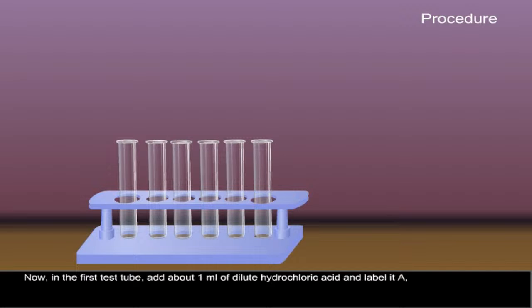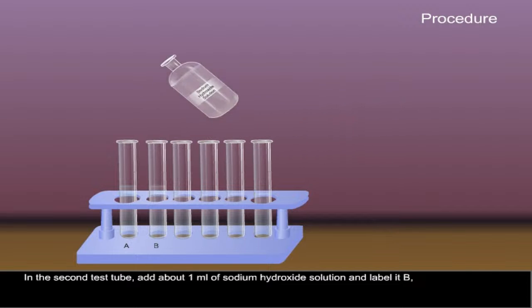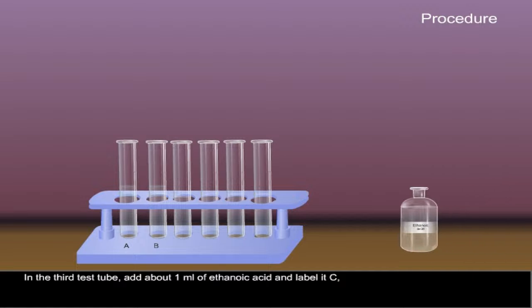Now, in the first test tube, add about 1 milliliter of dilute hydrochloric acid and label it A. In the second test tube, add about 1 milliliter of sodium hydroxide solution and label it B. In the third test tube, add about 1 milliliter of ethanoic acid and label it C.